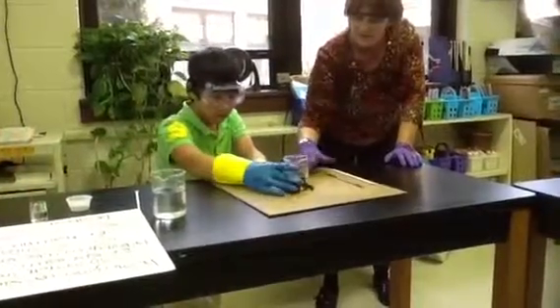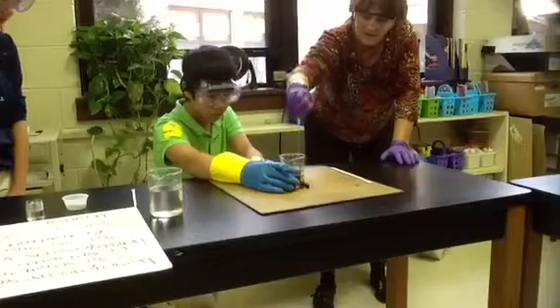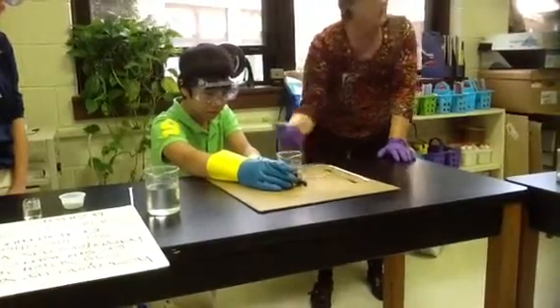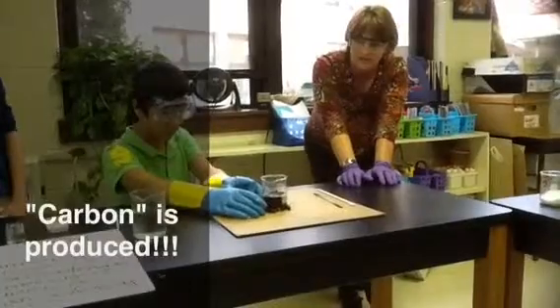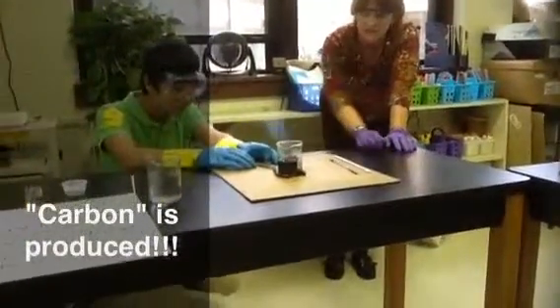Can you feel it? Will it just change color? Is it getting hot? I can't feel anything. Oh my gosh, it's starting to look like... Oh, yeah, I can feel it. Okay, all right. So he's feeling a lot of heat coming off from this. With the sulfuric acid, H2SO4, it's starting. As you can see, there's a lot of color change occurring.